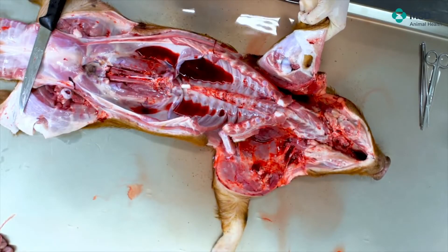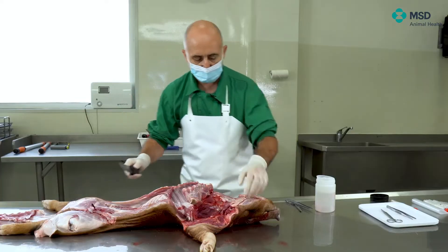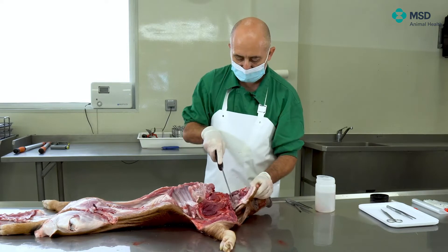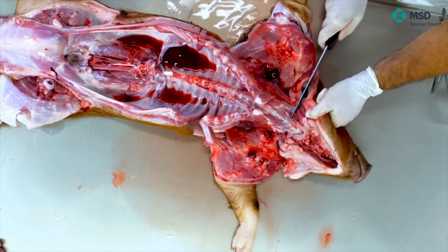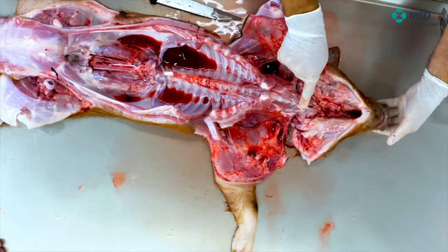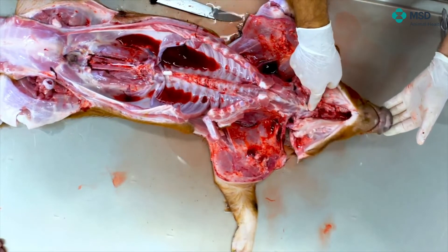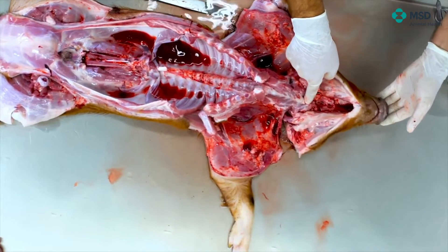Finally, we have to remove the head. The best way for removing the head is by removing the skin and the muscles around the head, especially at the level of the neck. By doing so, which is what I'm performing right now, we have to know where the joint exactly is. This is the atlanto-occipital joint, so we have to cut it that way.